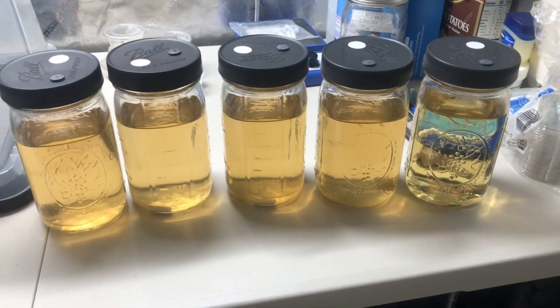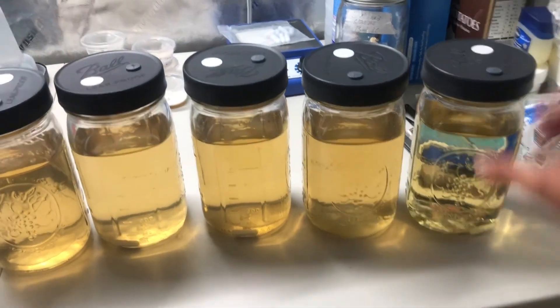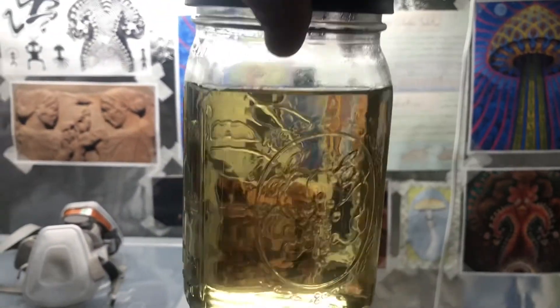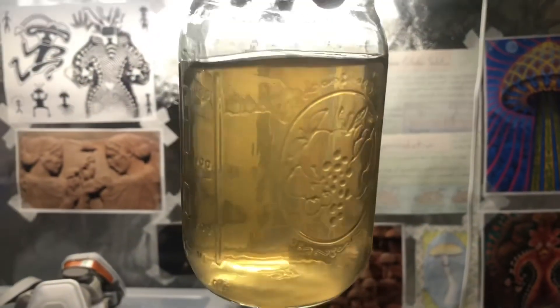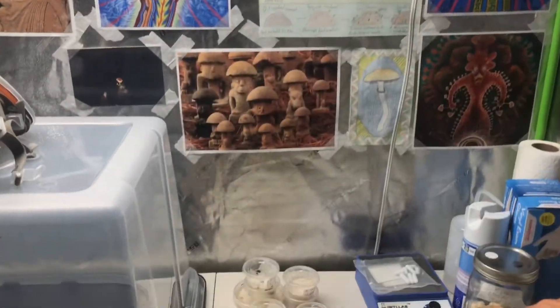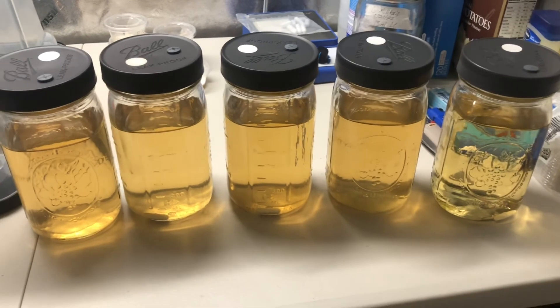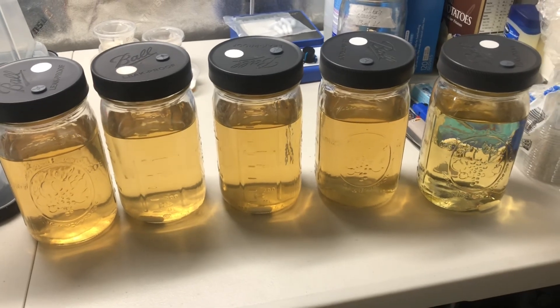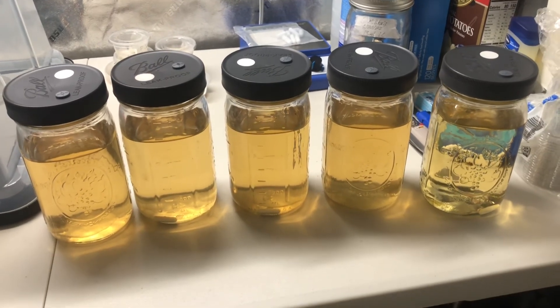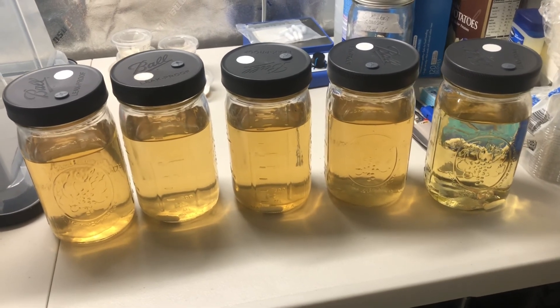I just pulled these guys out of the canner. These four are the light malt extract and this is the Karo. You can see the Karo will render a more transparent culture compared to the light malt extract, but both of these recipes should work. These are all sterile on the inside and ready for inoculation. I'll have a video out on that soon. Hopefully you found this video helpful — and yep, there you have it, how to make liquid culture.